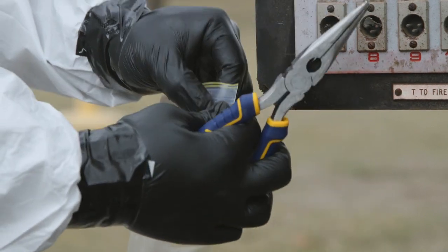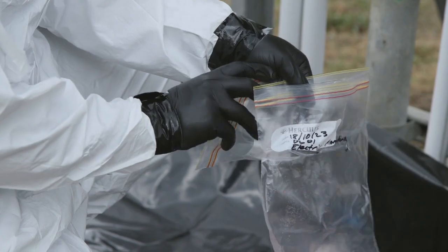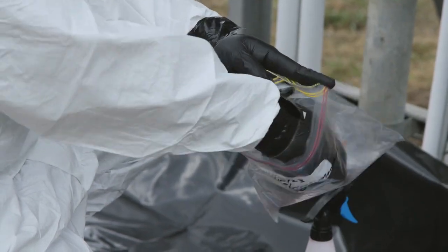Using your spray bottle, dampen the area you sampled. Once your sample is in the ziplock bag, you should double bag the sample.